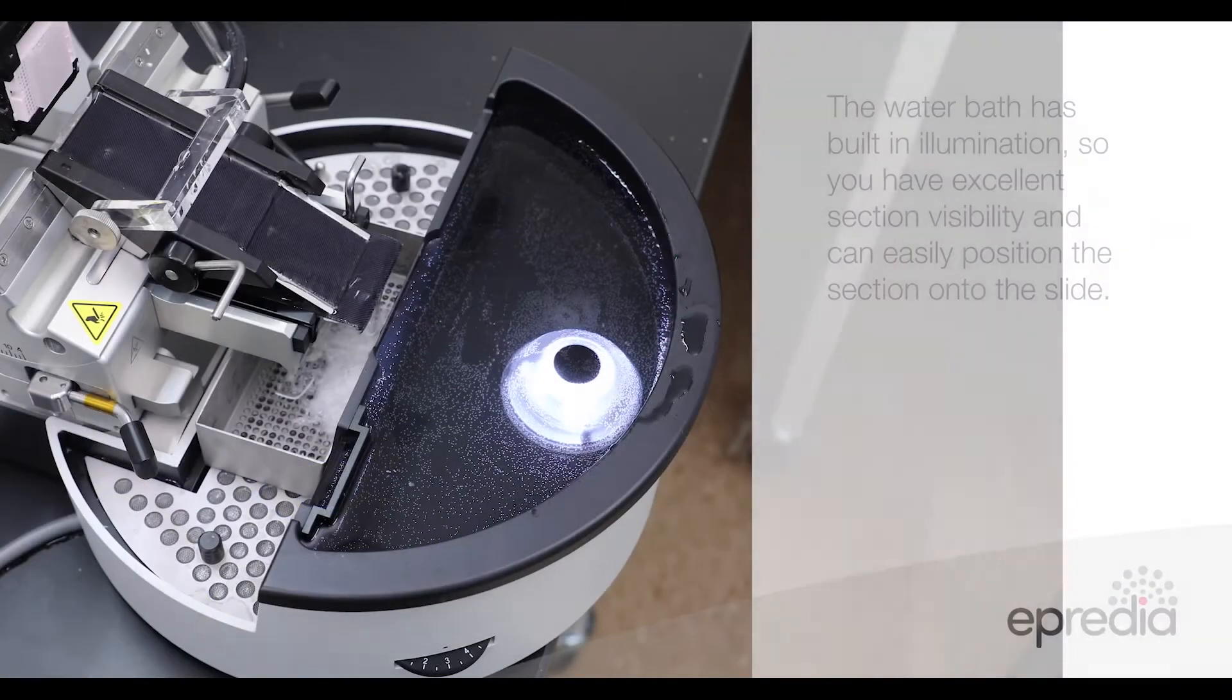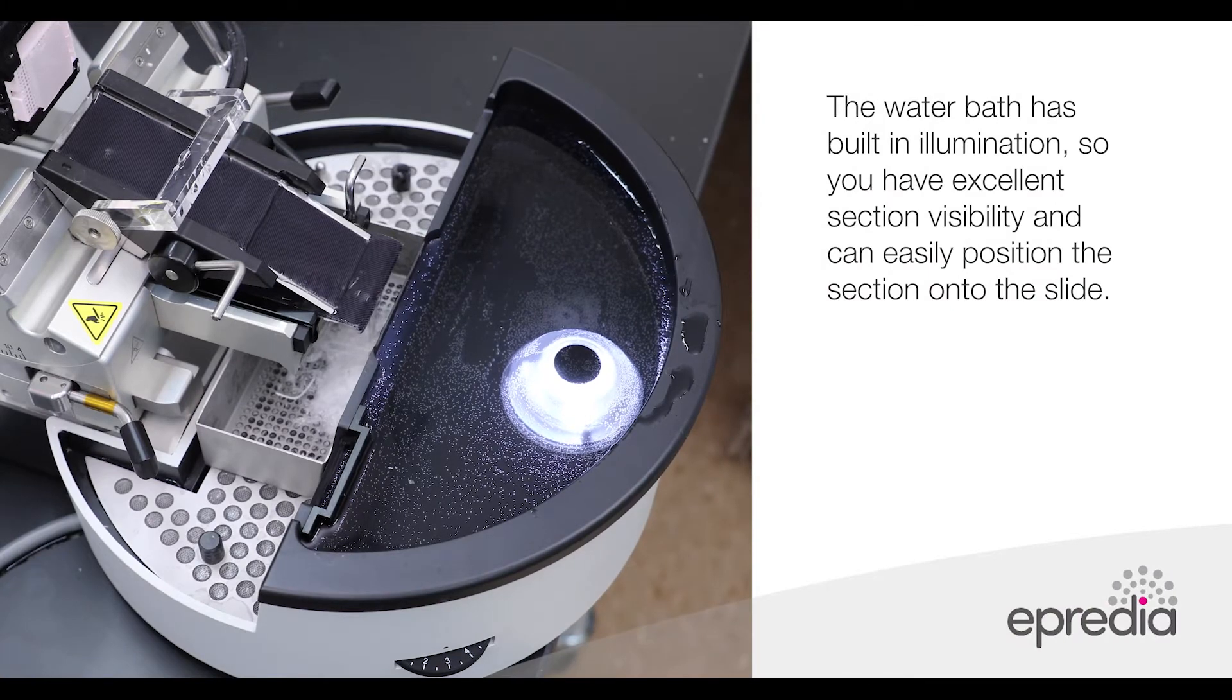The water bath has built-in illumination so you have excellent section visibility and can easily position the section onto the slide.